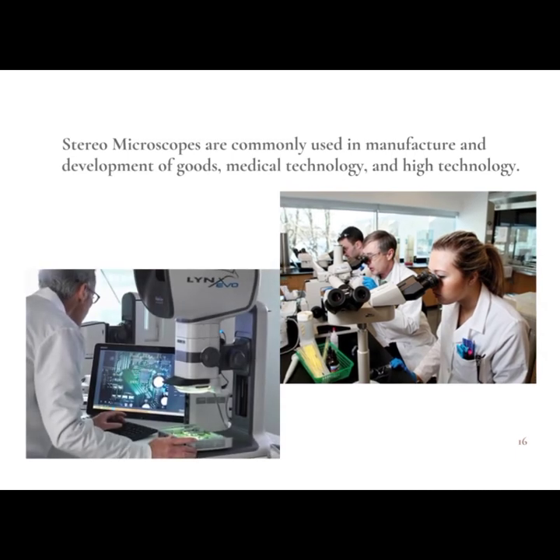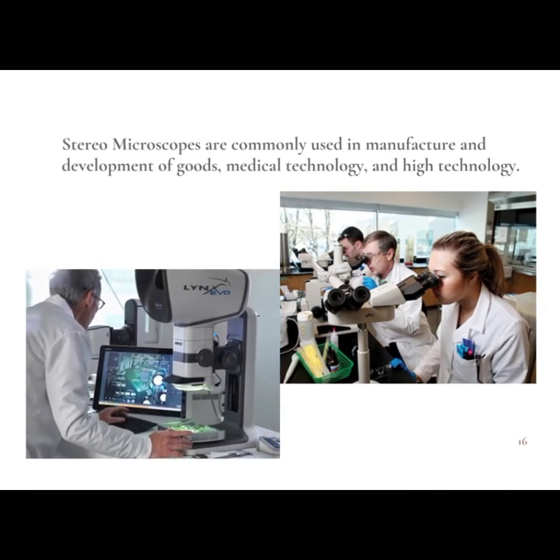Stereo microscopes are commonly used in manufacturing and developing goods, medical technology, and research. Specifically, they are used for dissection of samples, inspection of fractures, microsurgery, cleaning and analyzing fossils, dermatology, forensic engineering, studying living and non-living things, topography, and many more.